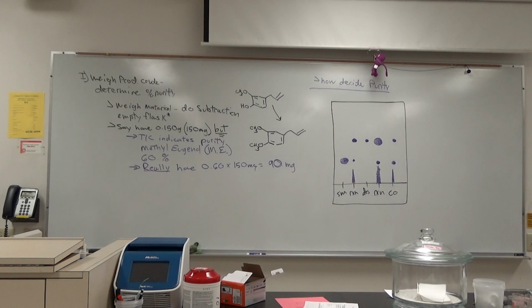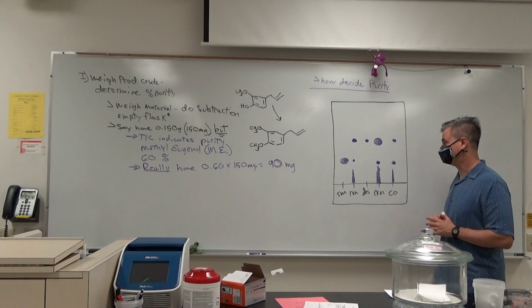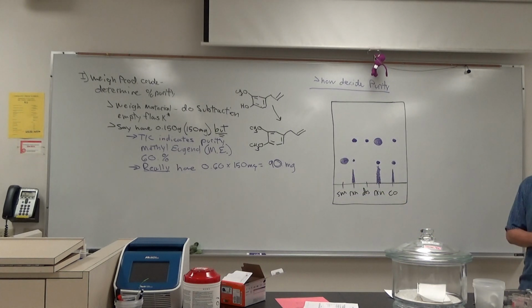Based on size of my dots. More of the reactant, the starting material. Because that's so big? Yeah, awesome. You fell into the trap. I wanted you to fall into the trap.